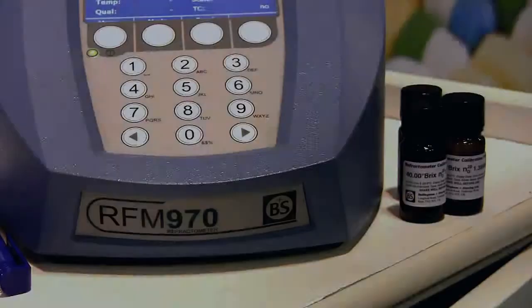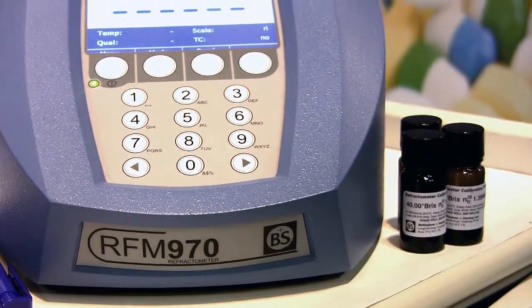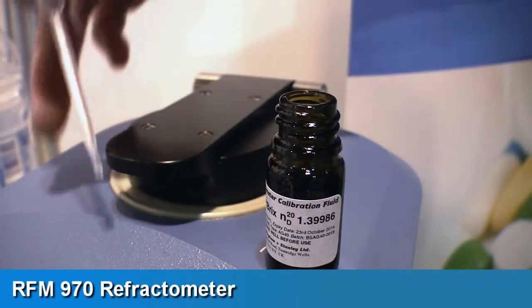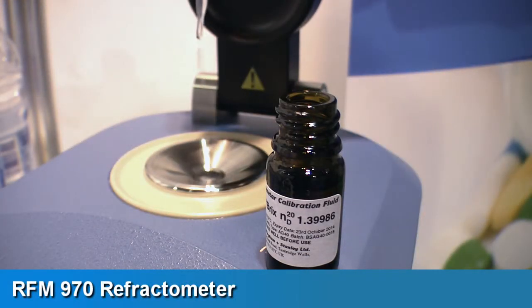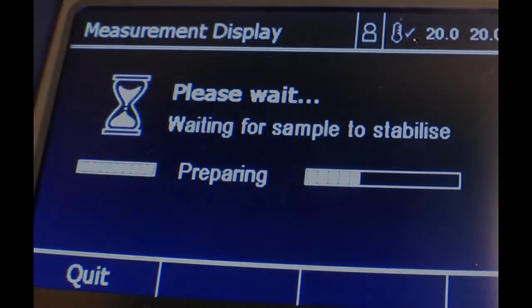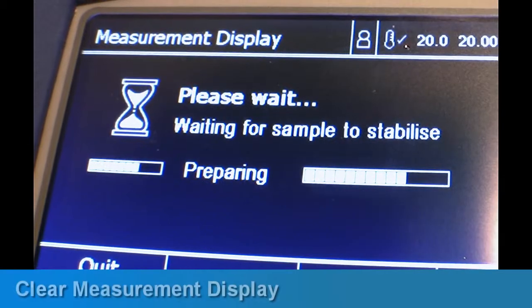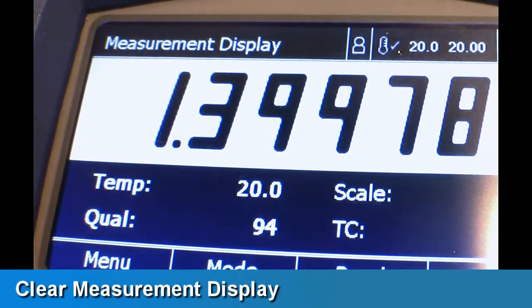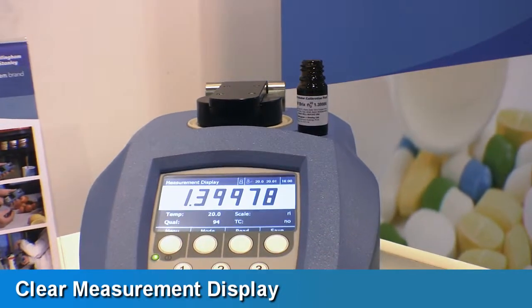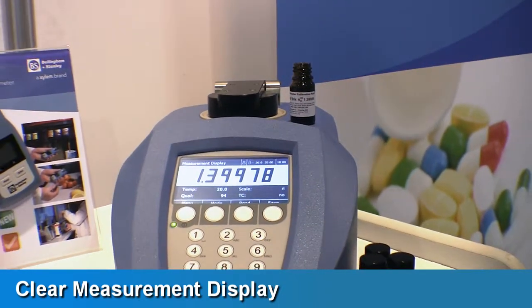The RFM900 series of refractometers from Bellingham and Stanley replaces the old 800 series and combines the latest optoelectronic principles with ease of use and great durability. It makes sample application and cleaning so much easier by incorporating a new low-profile sample dish and non-contact presser, and up to 700 stored results can be viewed via the display in tabular form.